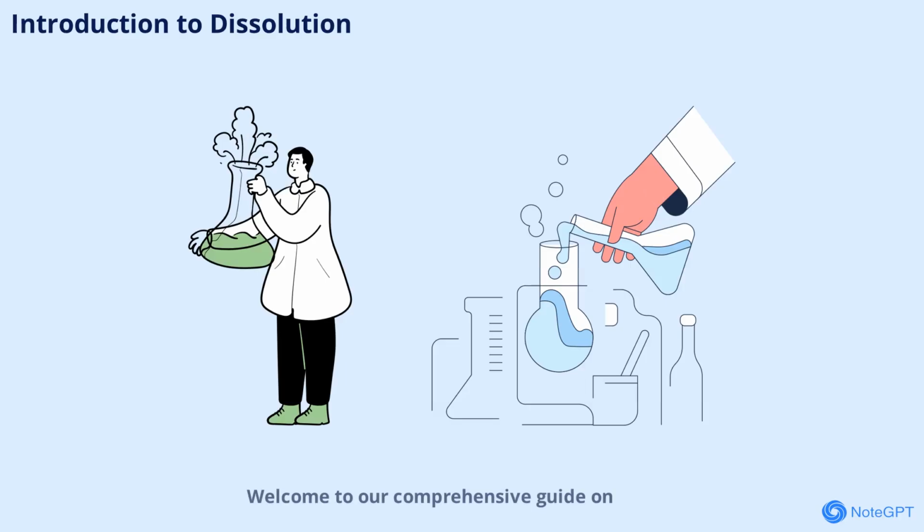Welcome to our comprehensive guide on the development and validation of dissolution procedures. Dissolution testing is a critical quality control tool in the pharmaceutical industry, ensuring that drug products release their active ingredients appropriately. In this video, we'll walk you through the essential steps, apparatus, and validation strategies for robust dissolution testing. Whether you're new to the field or looking to refresh your knowledge, this series will provide a structured overview, starting from the basics and moving into advanced considerations.